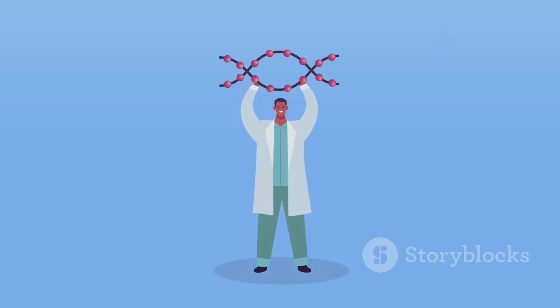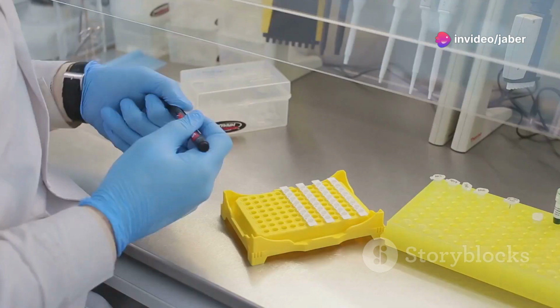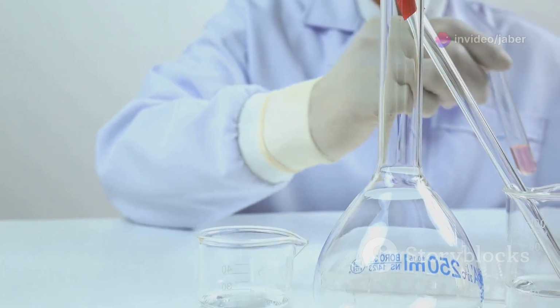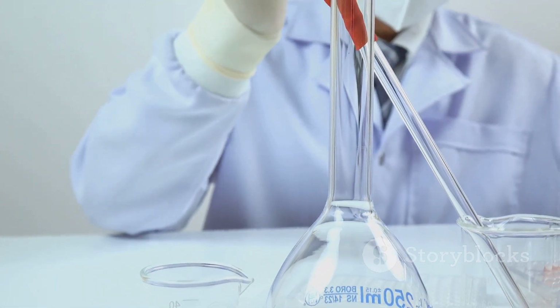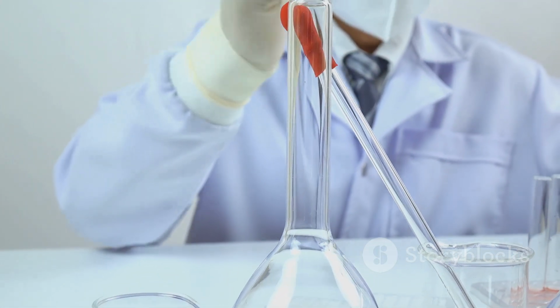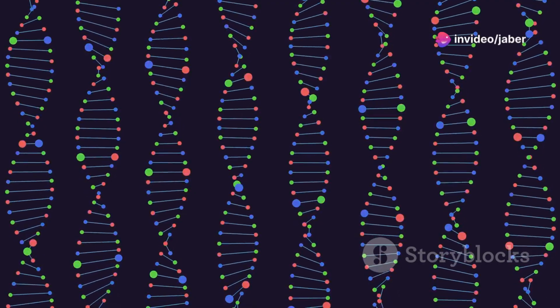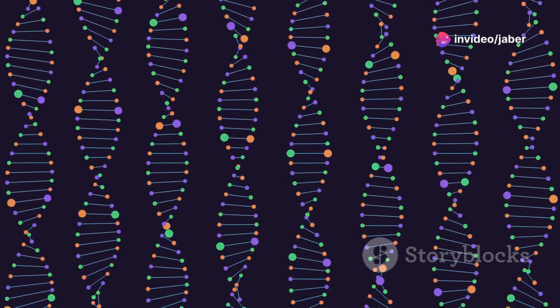RNA, or ribonucleic acid, is like the messenger molecule of the cell, carrying genetic information from DNA to the ribosomes, where proteins are made. RNA Seq, short for RNA sequencing, helps us analyze the abundance and types of RNA molecules present in a biological sample, providing invaluable insights into gene expression patterns. It's like listening to the symphony of genes playing inside our cells.